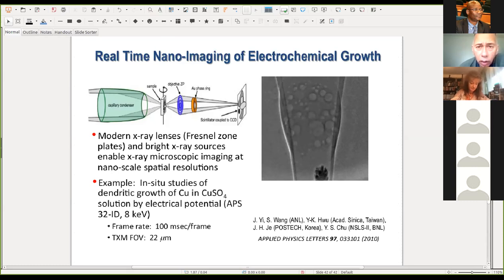Yeah. Because in your presentation, you talk about solids and powders, but I don't see where you talk about thin films. Sometimes I work with thin films, but with the in-house diffractometers we have no signals, but sometimes I see you use synchrotron. I think if we use it, is it not possible to destroy the quality of the films with the beam lines?